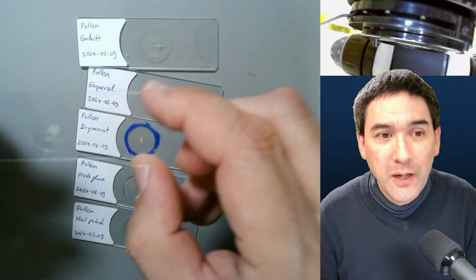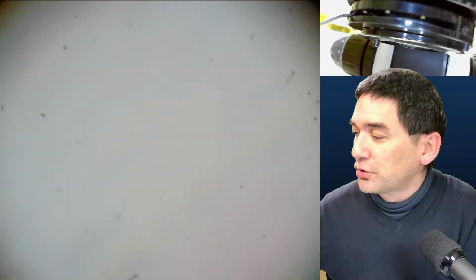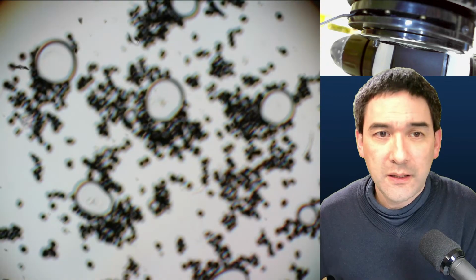Okay, so I'm going to start off with this one over here, and I'm going to now go over to the other microscope. So this one that you see up here is not valid anymore. Okay, so it's my other microscope that I have. And this is now mounted in pure glycerin, so it is not a permanent mount. Okay, and let's go here. Need to adjust everything, and this is how it looks.